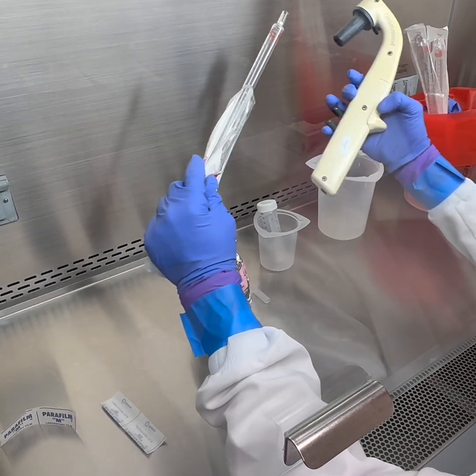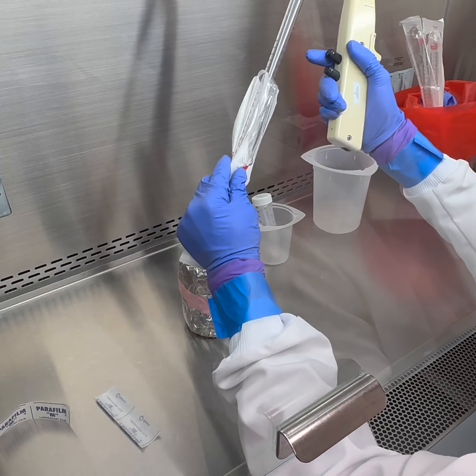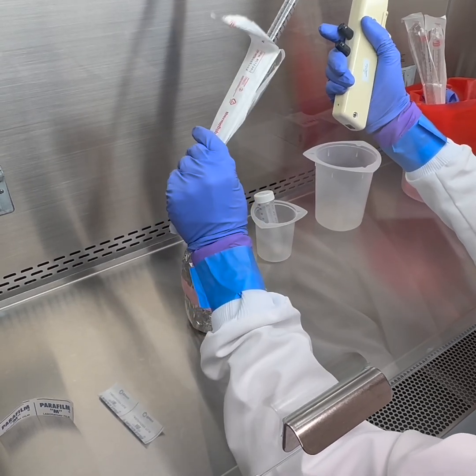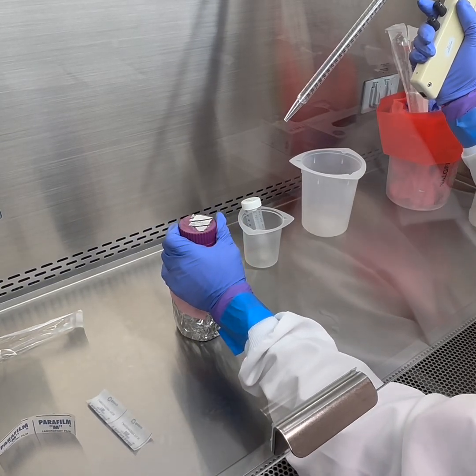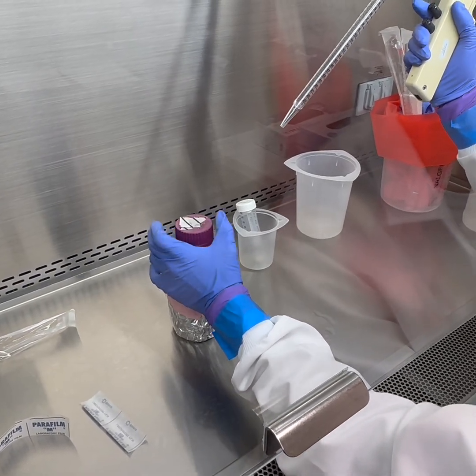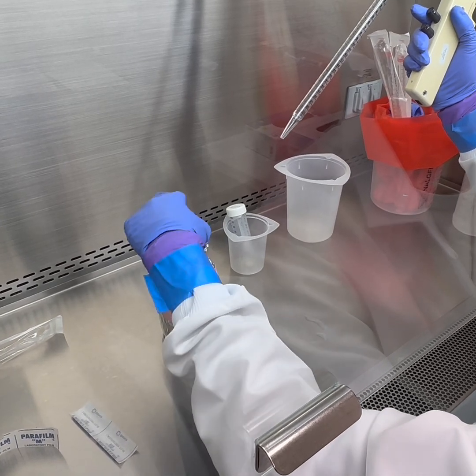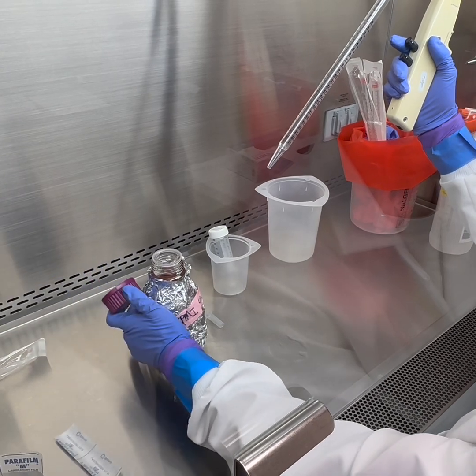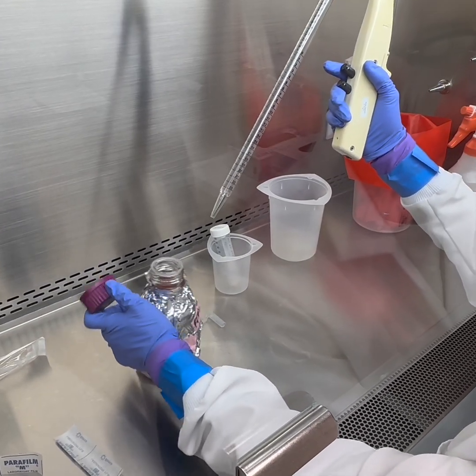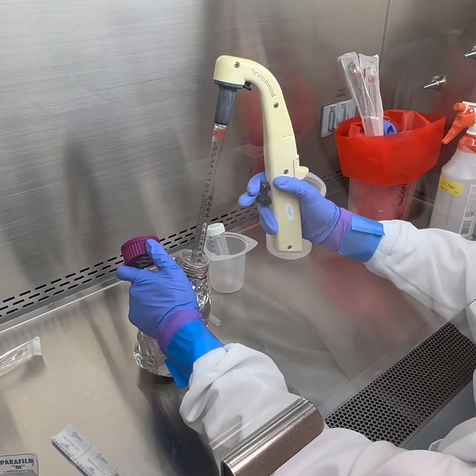It's going to depend on how long of a broth culture you had and how much media you had originally in the broth culture. So obviously, if you have more cells in your pellet, you're going to need more RPMI to dilute it down to the target concentration. But the goal of this step is just to get it in the ballpark so that we can count, and then we'll make a dilution.